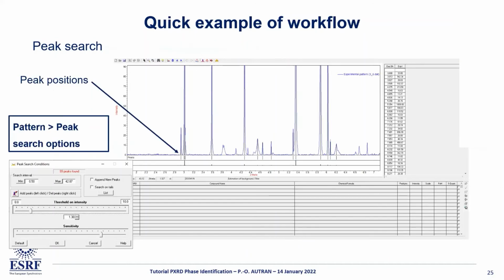And the next step is to tune basically what peaks I want to identify and what peaks I don't want to identify. If you look at the first try here, the default values, you see I am missing quite a few peaks.